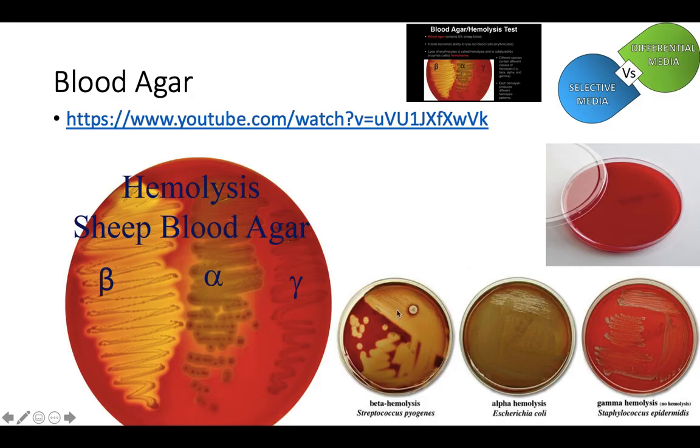This beta hemolysis, you can see completely through if you were to hold it up to the light. This one you can't. It's just kind of a funky, greenish, yucky grossness. And this is the same thing that happens to meat on your counter. You leave it out too long, and it gets that brownish yuck to it, just because it comes in contact with UV light and oxygen.